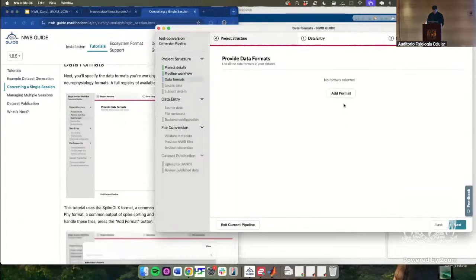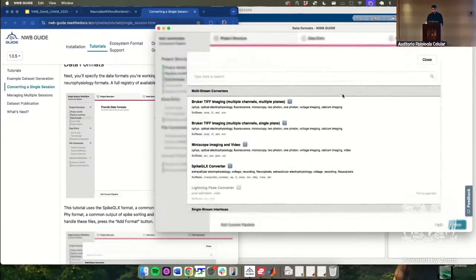Sorry, this is very important for me, at least for the beginning. So you can convert all your data in this NWB format and not upload it to the platform for a while, at least. You can, yeah, they're just files. You have papers or something. Yeah, and I would encourage doing that because that will allow you to build your analysis pipelines upon NWB, right? And then when you share the data, you can also share your analysis pipelines. Right. Yeah. And also these NWB files use a special compression, a lossless compression algorithm, so these files tend to be quite a bit smaller than your source data files. Fantastic. So it's just a nice bonus.